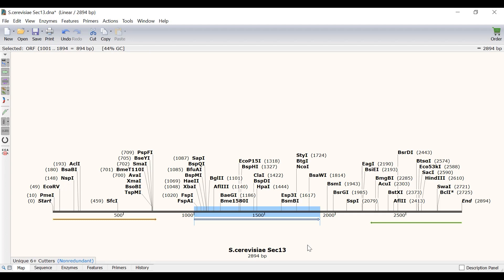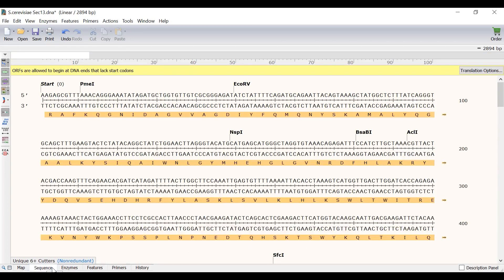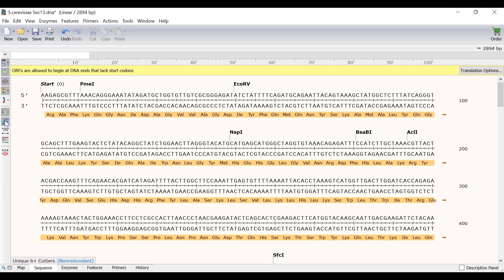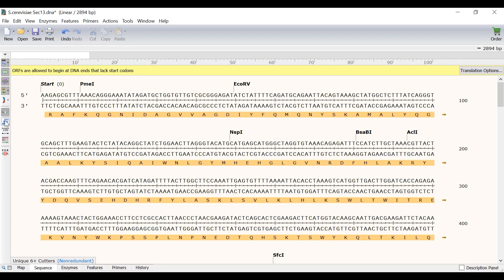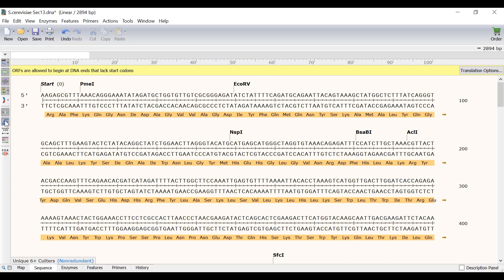I will now switch to the sequence view for a better look at the sequence. You will notice that for open reading frames there is a separate track that displays the amino acid sequence. To use the three letter amino acid codes instead of a single letter amino acid code I can use the button to the left.